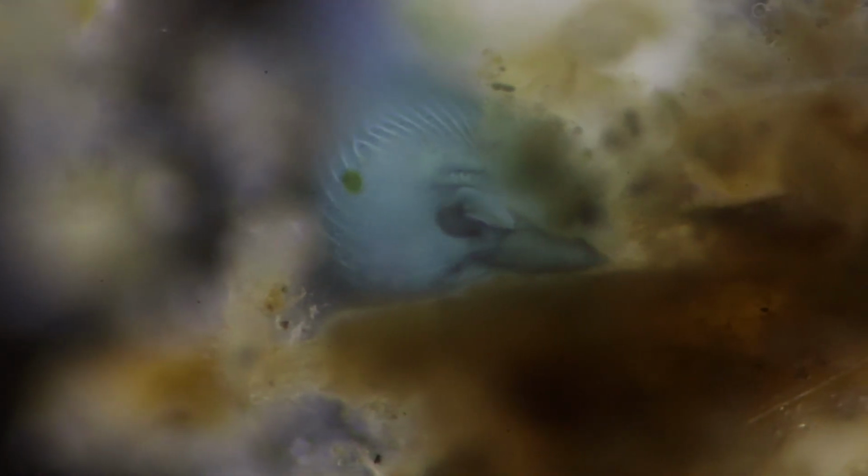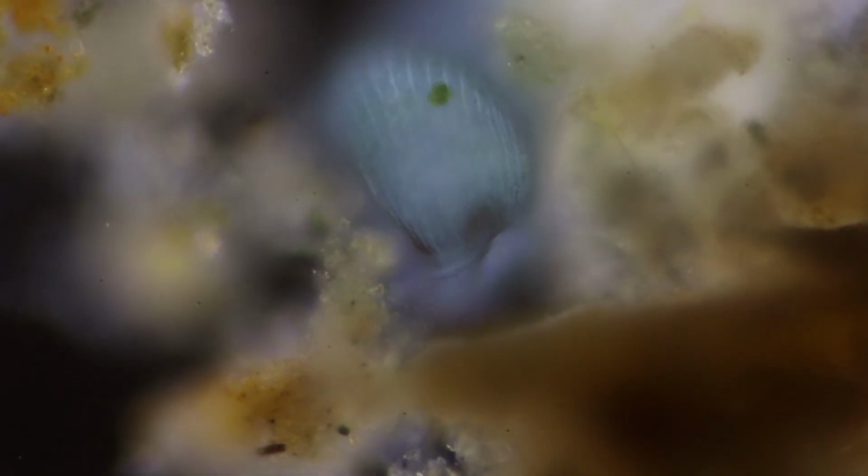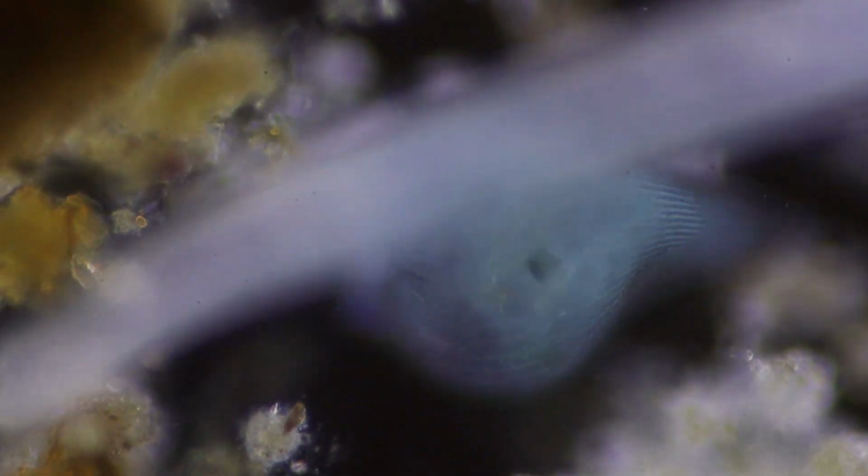But still here you can see that little food vacuole. And at the end of the video, something actually gets sucked in it. And then once it goes through that, it's taken to the central vacuole. And you can actually see some stuff in there right now, because that's essentially its food storage.